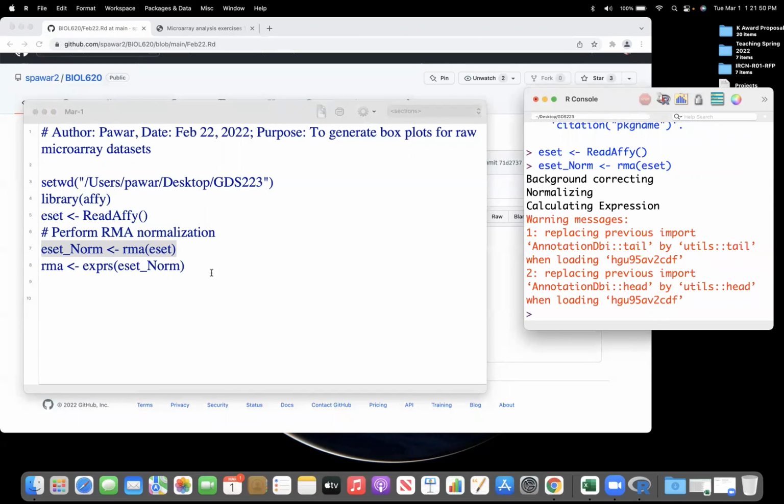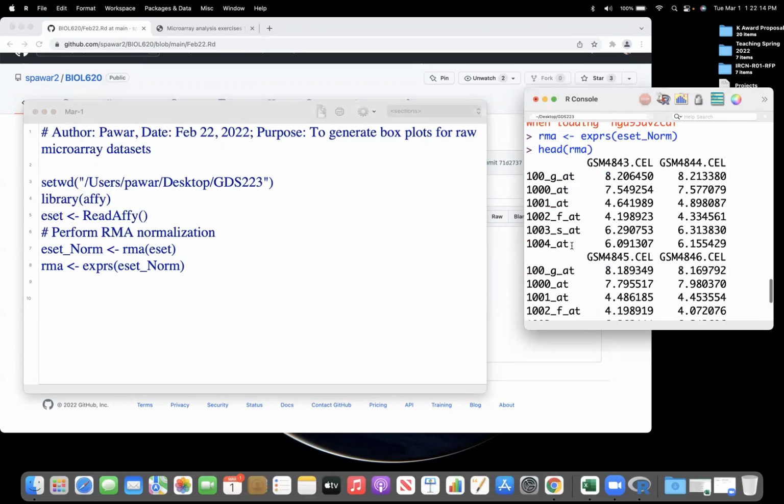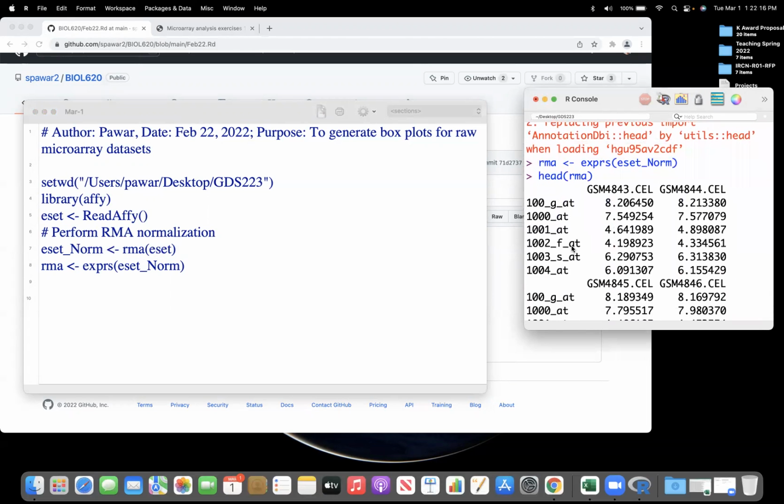Learning my hashtags like last time. The hashtag here, yeah, you want to have that. This is just a comment. Okay, so I'm ready. Let me know when you're ready.